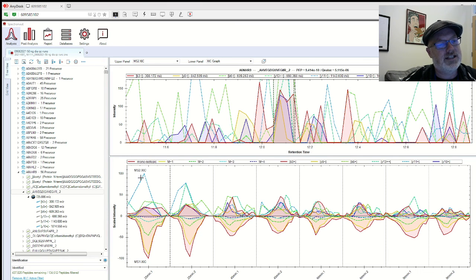So like this blue one, for example, seems like it lines up here, but on this one it doesn't. So I think it actually looks at interference across all your runs and not just your individual runs. So turning on or off interfering peptides may be a good thing for one sample, but might not be good for quantifying it across multiple samples. That's cool. Really cool. DIA is awesome.